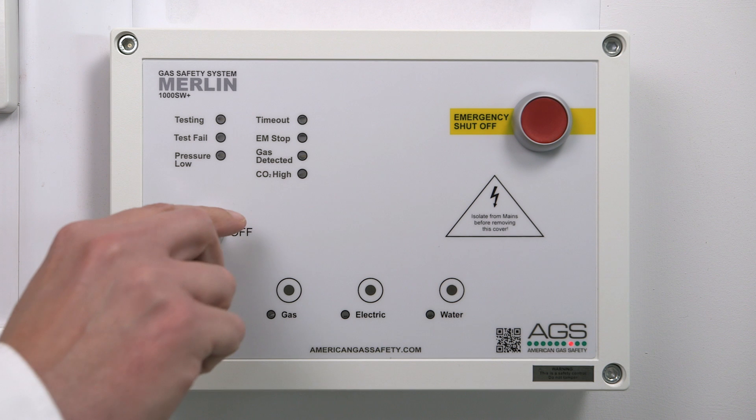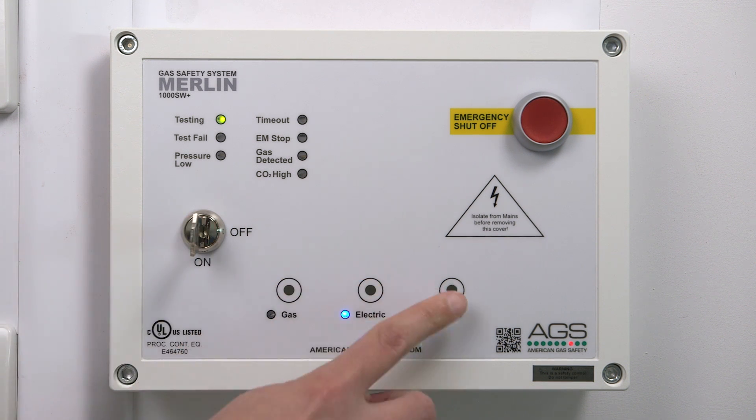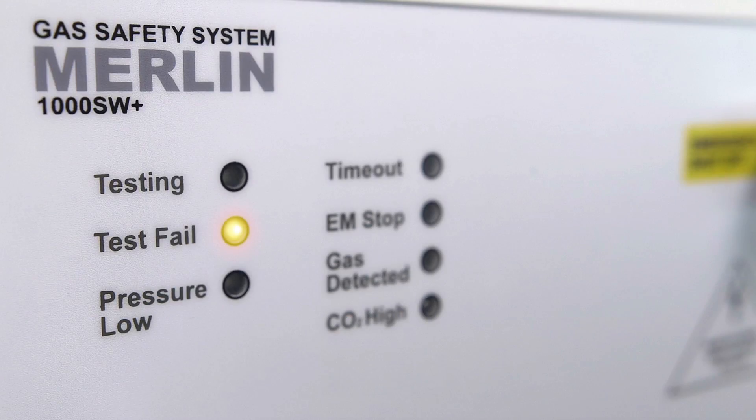The unique feature of the Merlin range is the utilization of a pressure transducer on the gas line. Once gas is selected, the panel will perform a pressure drop test. If the gas turrets are open or the gas line is compromised, the panel will go into test fail and not allow the gas to be supplied to the classroom.